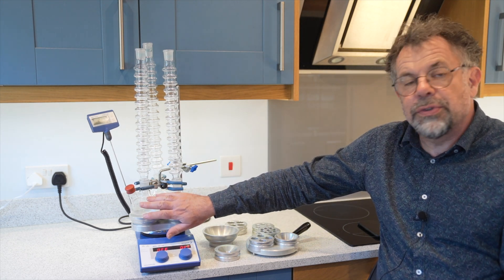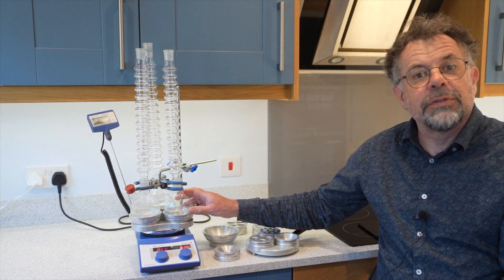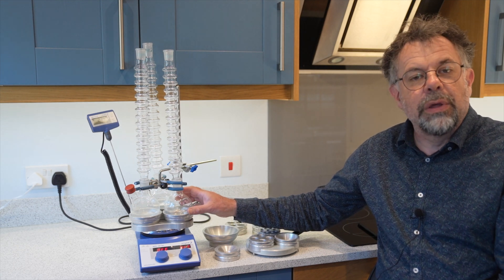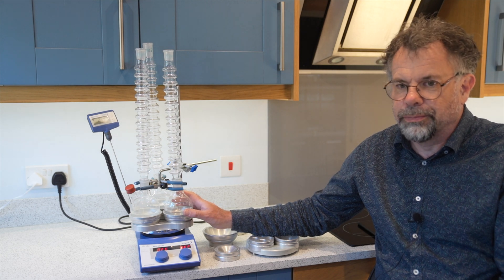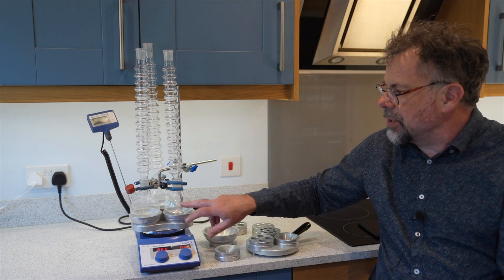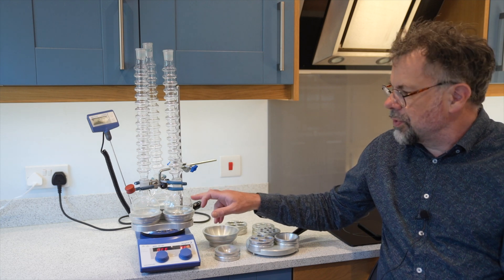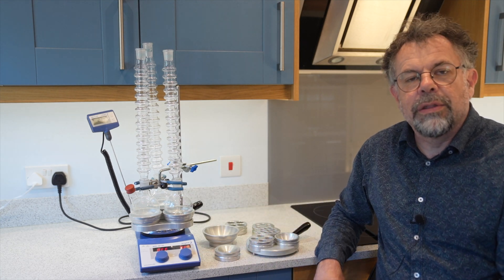Round bottom flasks — we use a standard size so you don't have to buy anything special. You can use standard round bottom flasks from your local supplier, just make sure they meet ISO specifications, which is quite important. Here you can have a flask with multiple necks quite easily. There's plenty of space to have two, maybe even three additional side arms on a flask, depending on the availability from your supplier.